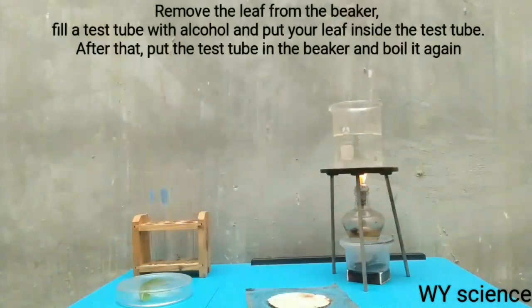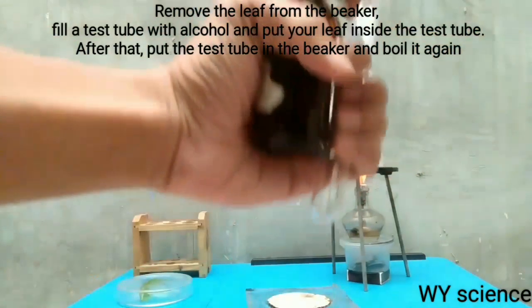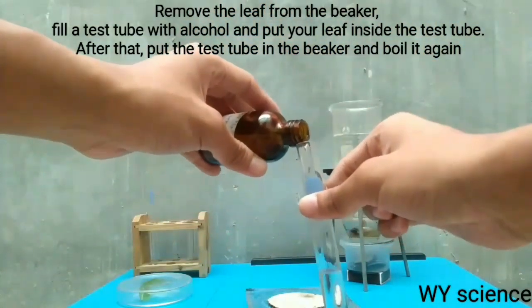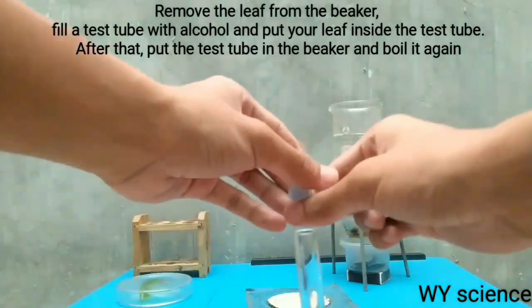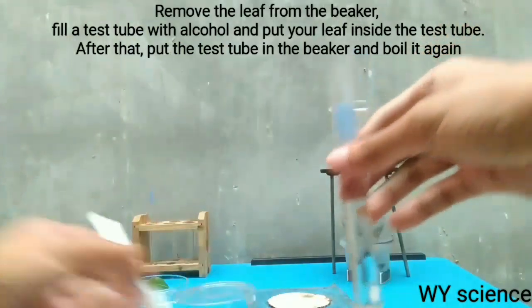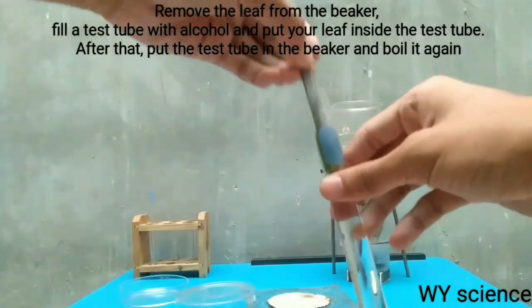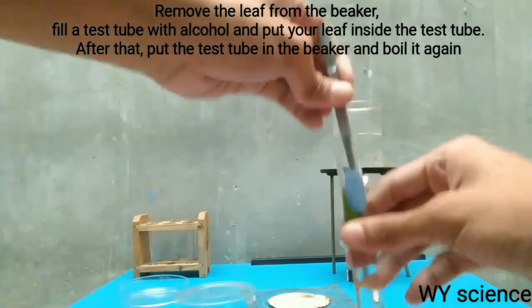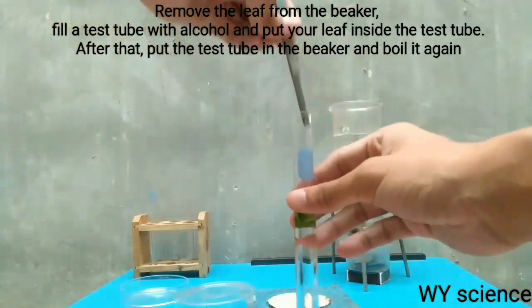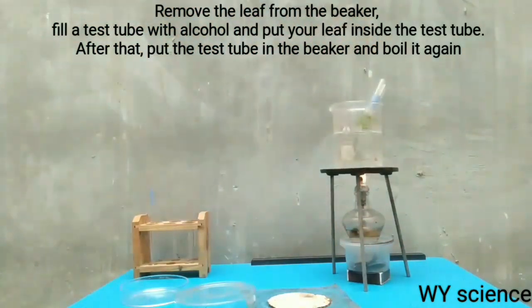The next thing to do is to remove your leaf, get a test tube, and put alcohol in it — we are going to use 90% isopropyl alcohol. Then get your leaf back, put it inside the test tube, try your best to fit it inside, and then put the test tube in the beaker, like this.